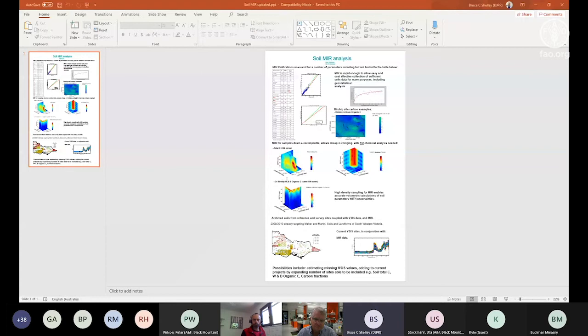Stable lab environment's critical for new players. Temperature and moisture, particularly at the NIR end, that's where we most notice the effect of moisture. Consistency of predictions between labs. It's important that NATA are involved now in running proficiency, because if we're not getting reasonably consistent results lab to lab, that will be a risk to the actual credibility of the technique, and that's a big thing. And QC and uncertainty of the predictions is an area that we're going to have to get a grip on as well.